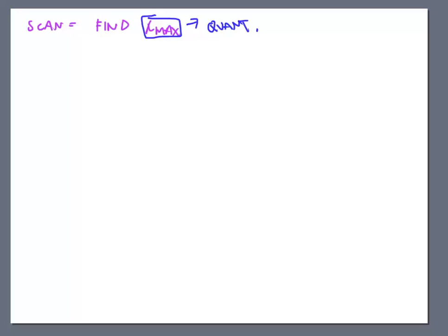That is it. And I keep repeating this over and over because no matter who you are, if this is your first time looking at a UV vis instrument, this is the number one common problem that people have. They think that because they bring a sample into a lab that they can scan that, and scan another sample and scan another sample and scan some standards that they have made, and then use these scans to do data work, and they can't. Doesn't work that way. Scanning is only used to find the lambda max, which is the number that you should run everything at when you make it.